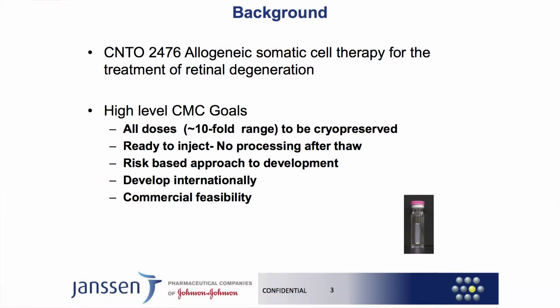The product is ready to inject, meaning that after it's been shipped to the clinical site, it's thawed and aspirated and delivered through a microcatheter. So that's the only handling steps. There's no processing in terms of reformulating or diluting. The important criteria for us is delivering quality product to patients through the clinical development and commercialization of the product.